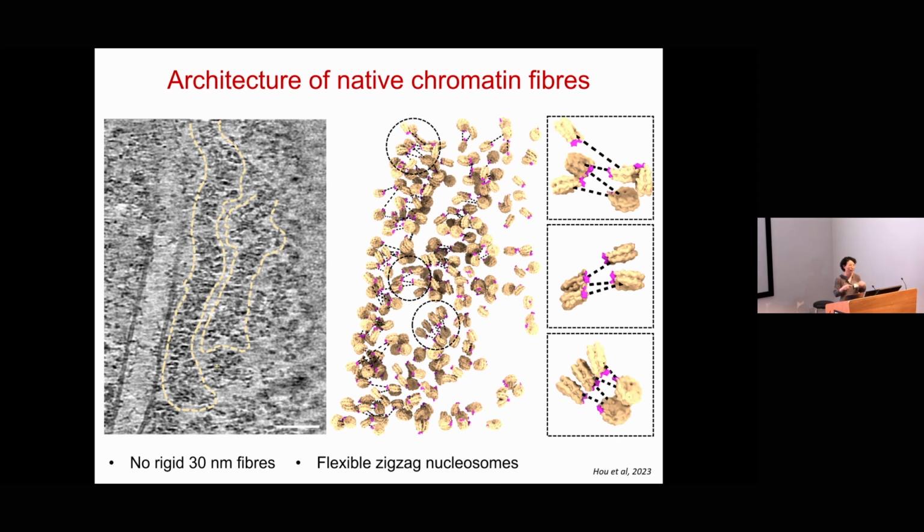We do look at the other cells. For instance, these cells are very difficult to see anything in. And we can also look at the different stages, like this is the interphase. You can look at mitosis, S phase, or other G phases, G1, G2. Now, of course, this is not our interest. This is a byproduct. When we looked at the control T cells, we suddenly saw many new things. This is what discovery is about. You have a new method, new technology on the horizon, and you use it, and you suddenly discover new things.